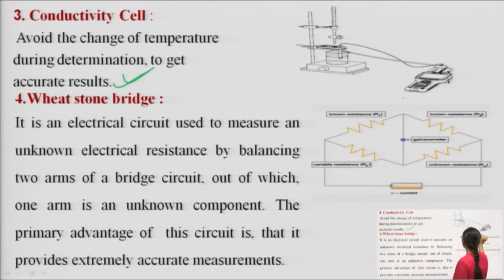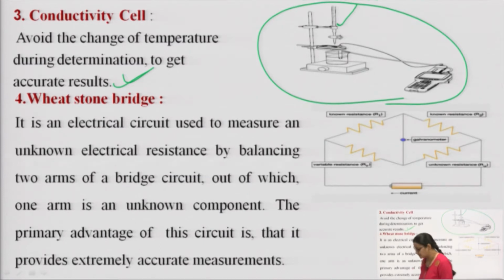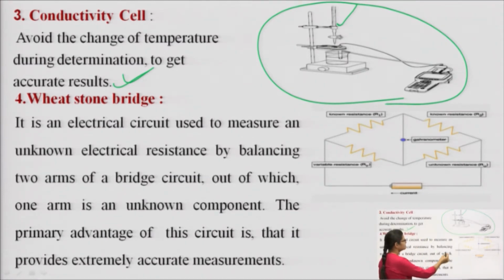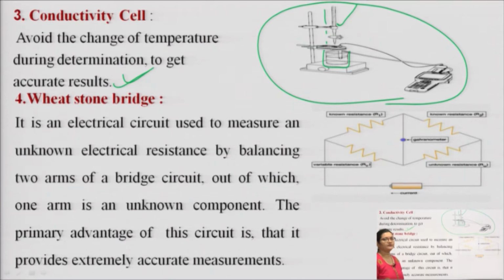This is the assembly of conductometric titration. We can see the burette from which the titrant is being added. In this beaker we have the primary standard solution, the electrolytic solution which is to be determined.